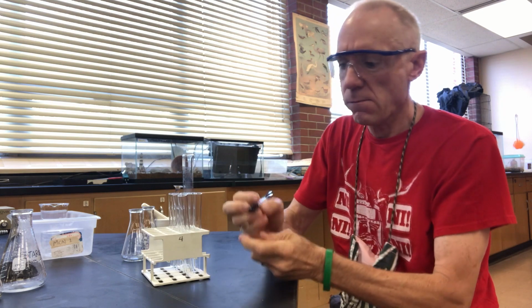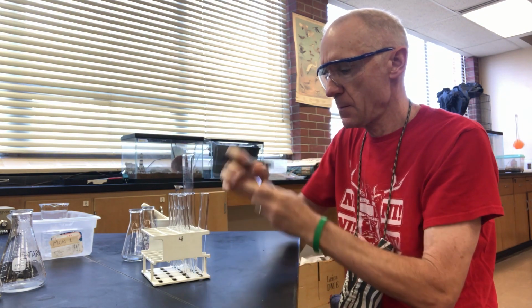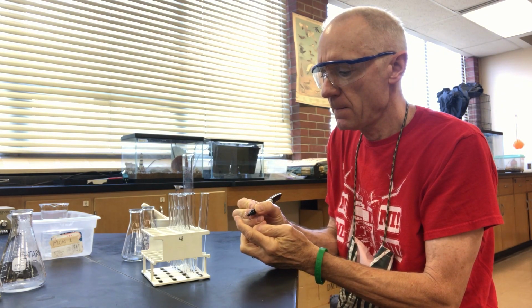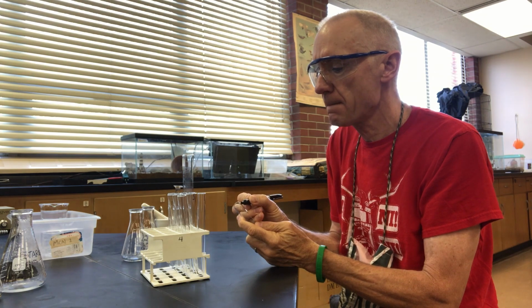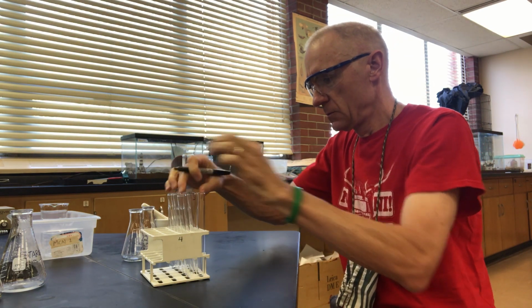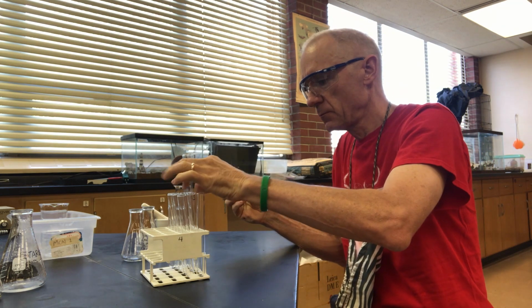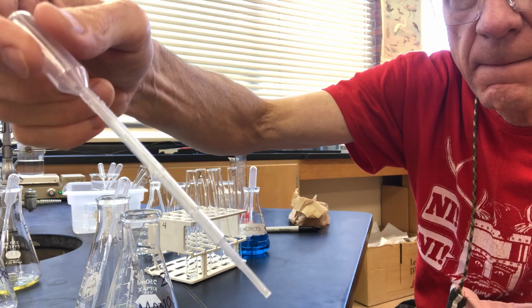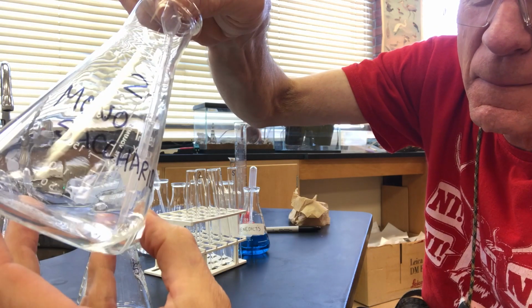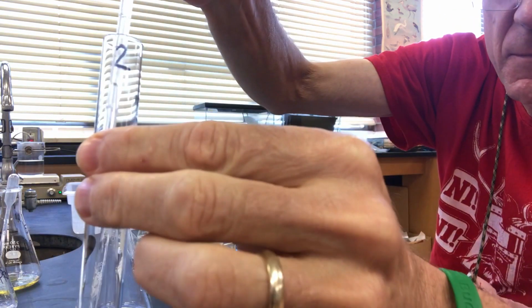To determine what a positive and a negative control for each reagent looks like, you will test each of the known 4 macromolecules and the water with each of the 4 reagents. Begin by labeling 5 test tubes numbered 1 through 5. We will use 1 for water, 2 for monosaccharide, 3 for polysaccharide, 4 for protein, and 5 for lipid. We will always test 1 milliliter of the various samples. Transfer the appropriate amount of each sample to the appropriately labeled test tube.